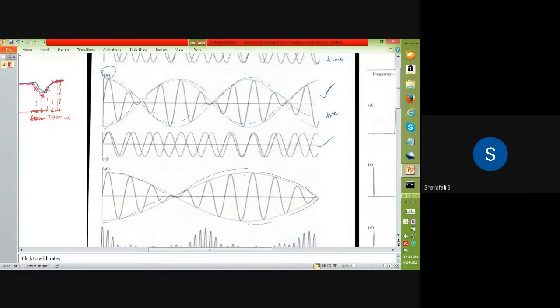When you consider the previous case, it is up to this point. Only half we are getting as compared to the previous. So with respect to the phase difference, we will get a different interference pattern. Even when we are considering two signals with respect to their frequency, we'll get a different beat structure or beat form.